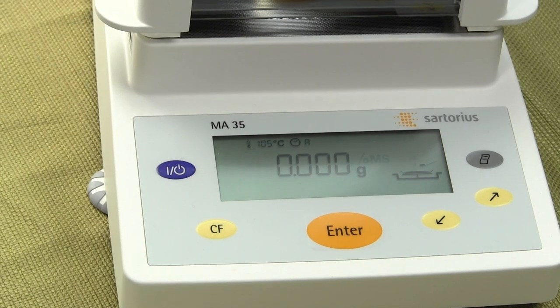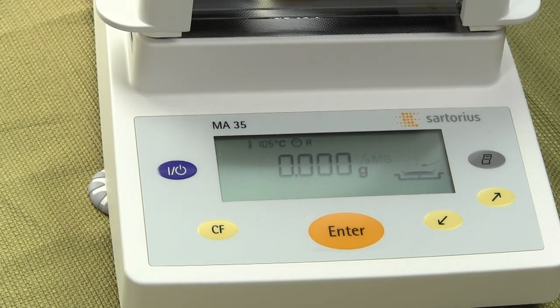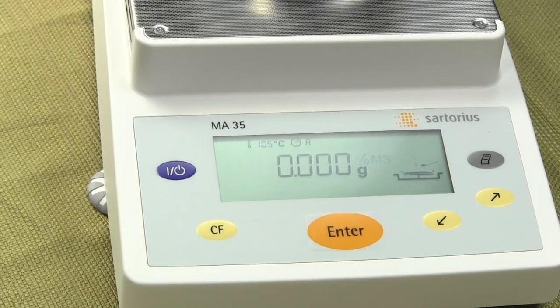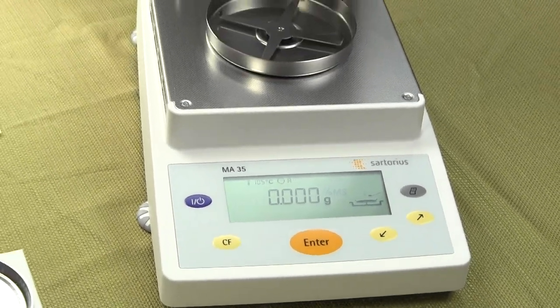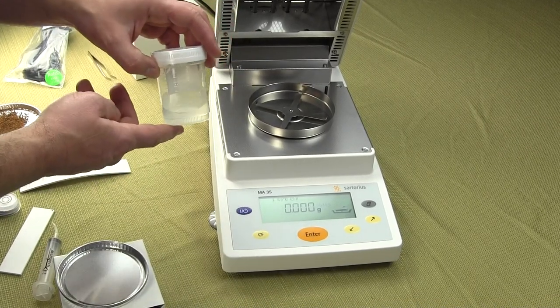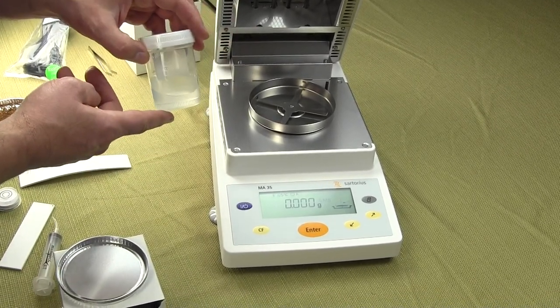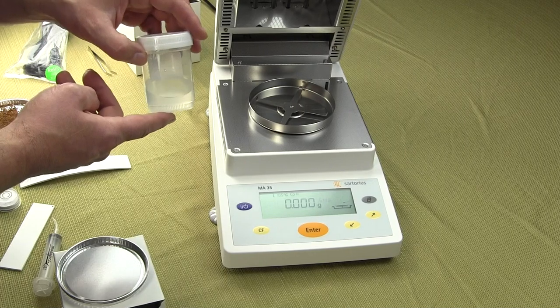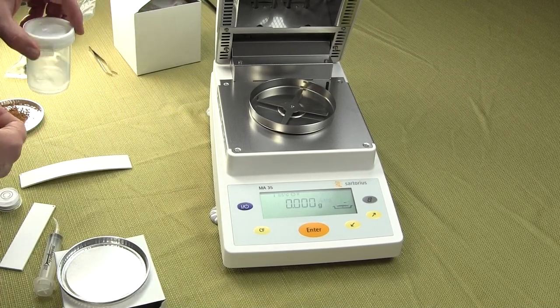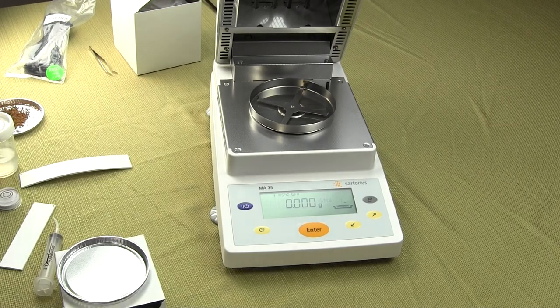The moisture balance does take a little bit of time to run a test. We've made a solution here — 90 grams of water and 10 grams of salt — so we should be getting approximately 10% solids.